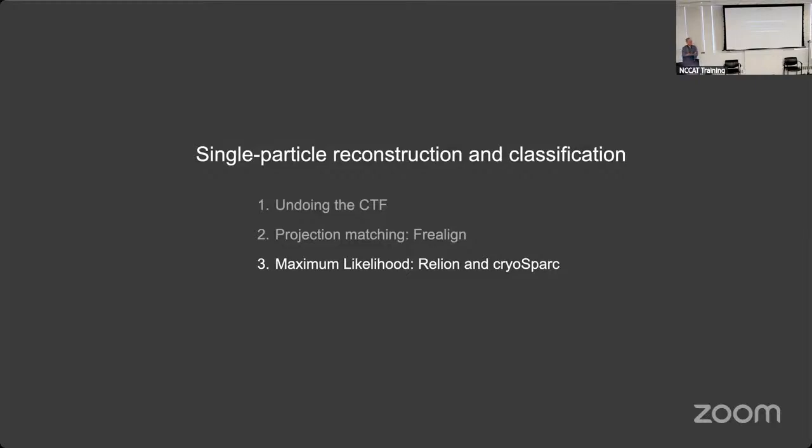You mentioned that this is an iterative process. What if, at the very beginning of this process, you had thought that there was a good match between image and volume, but as you go down the line, those original images aren't as good of a match? Yeah, so suppose you start off with the wrong volume. Then you're going to keep getting a wrong volume if you're not careful. So this is a danger.